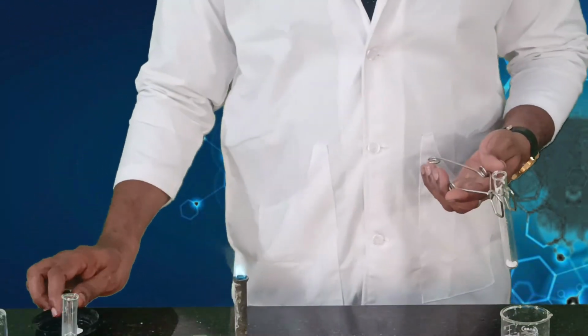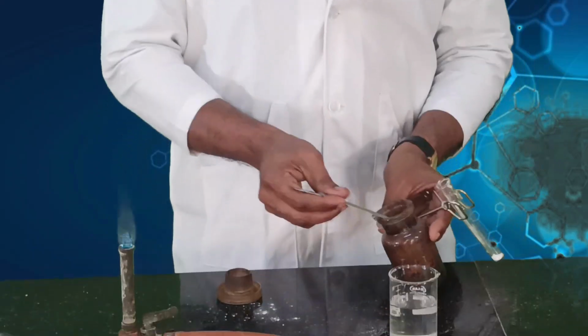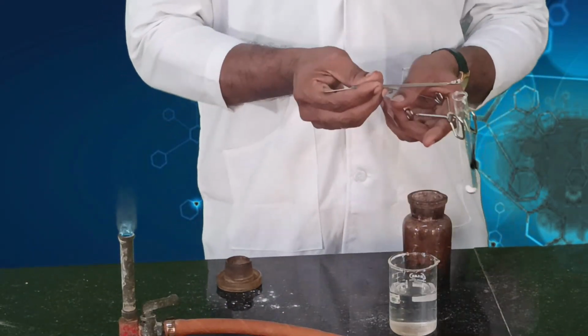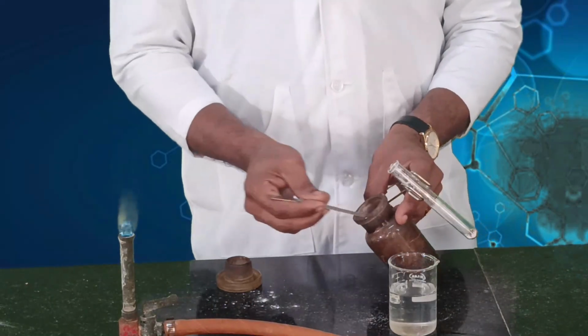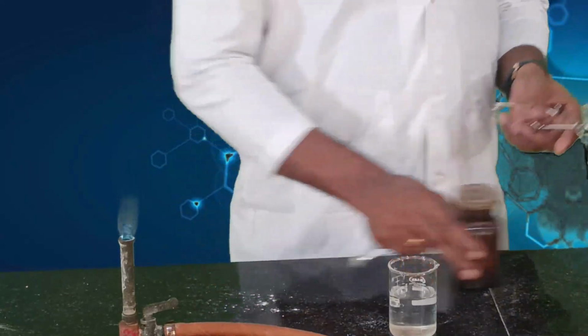Now you take the substance, take the given substance, add resorcinol to this, and a few drops of concentrated sulfuric acid.